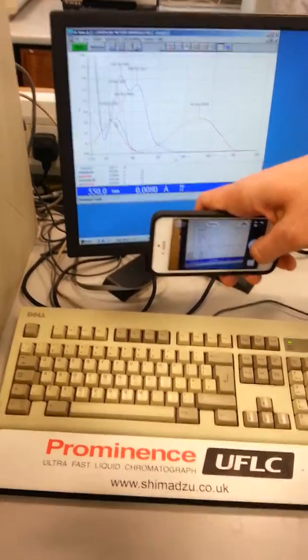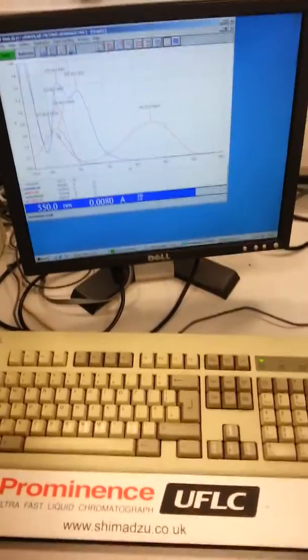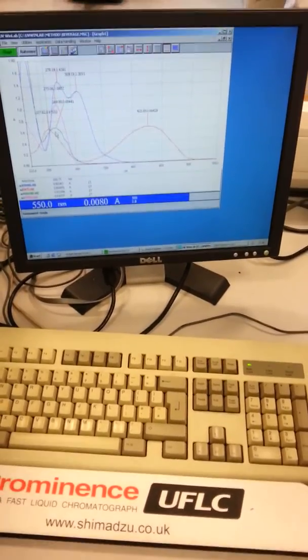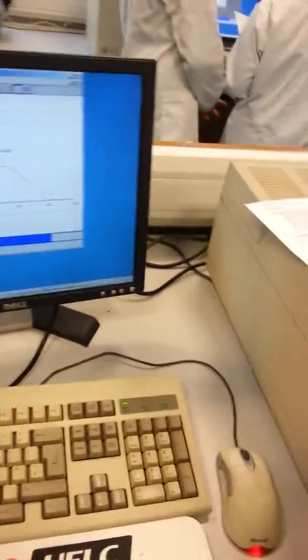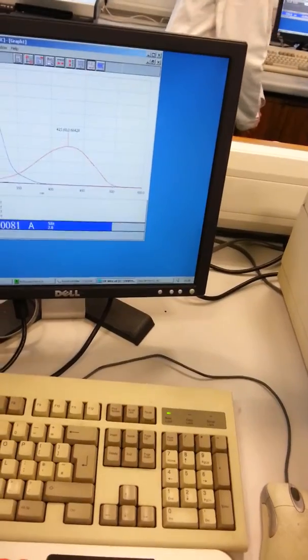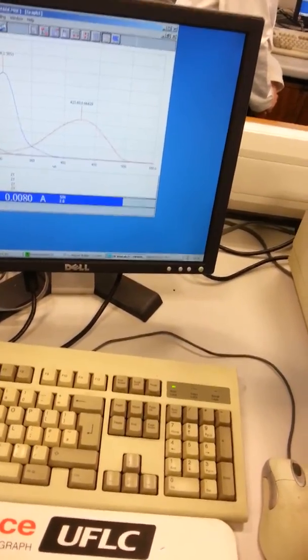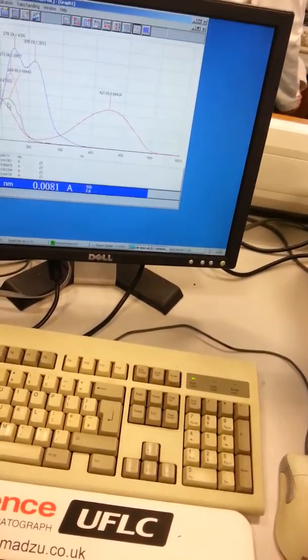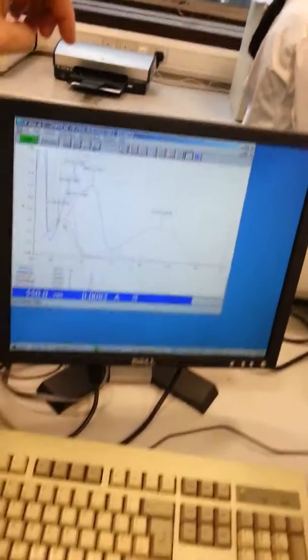So if the absorbance is 0.603. Whatever you do, don't forget to bring that wavelength with you next week, because we need that to program into the detector. And how accurate will that go? 258? Oh, okay. You mean in terms of rounding, there's no decimal places. That's an artifact of electronic interpretation. Wavelengths generally aren't fractions of nanometers. 259 then. Yeah, that's what we program in. So hang on, what was that? 259.